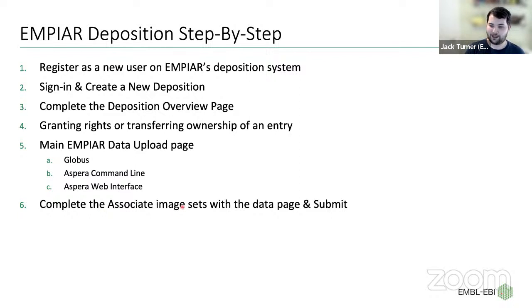And then finally, you complete the associated image sets with data page and submit. I'm not going to show you this. This is relatively obvious, just filling out forms and things like this.